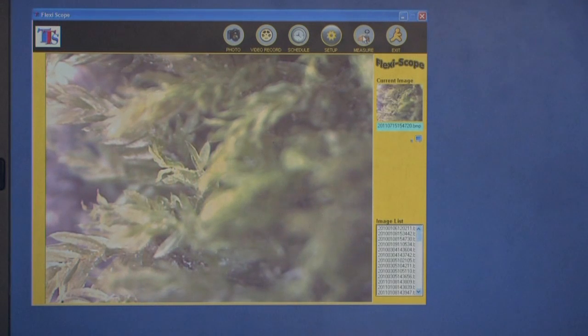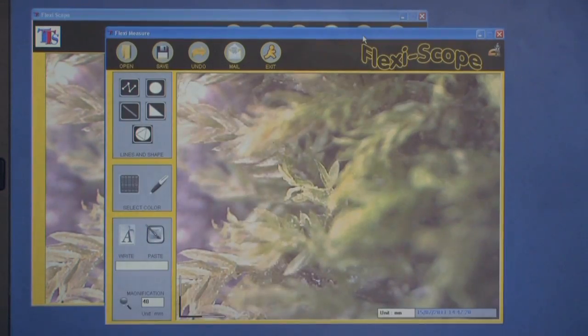The software that comes with Flexiscope is easy to install and easy to use. It even allows pupils to measure the objects on screen.